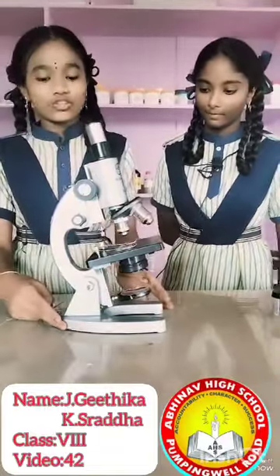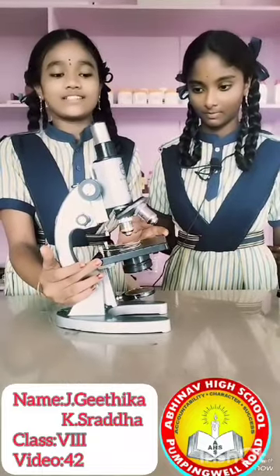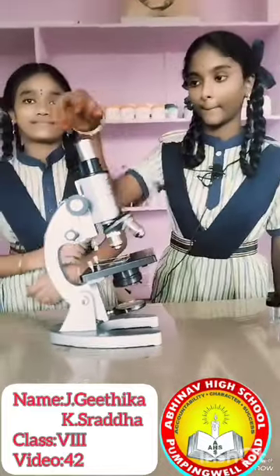This is the U-shaped base. This is called the handle, in a C shape. This is the fine adjustment. This is the stage. These are the lenses, 40x and 10x lenses.